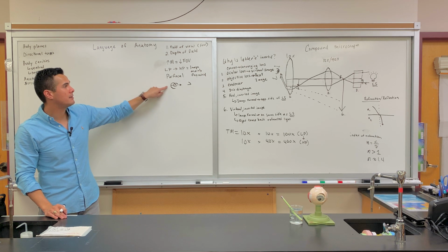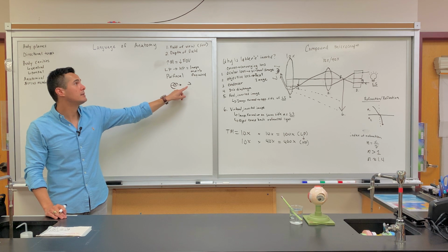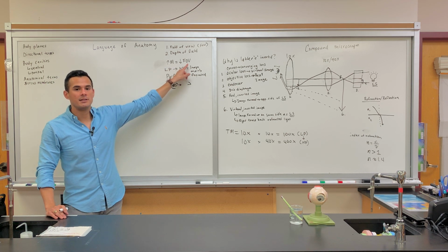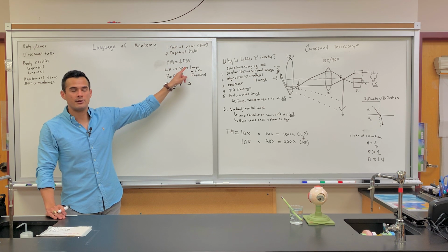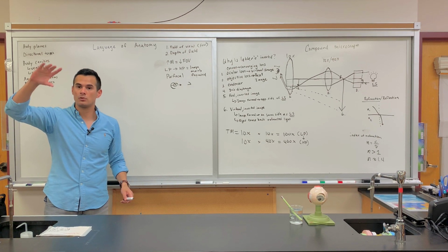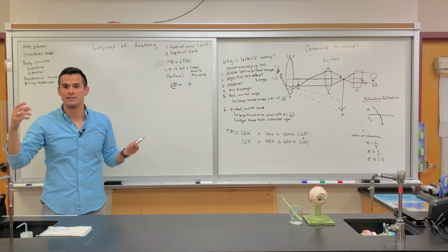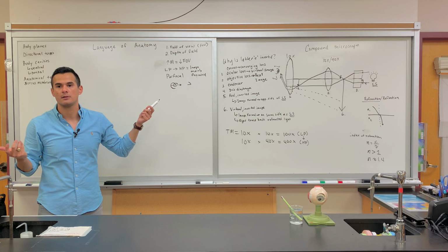So that was the field of view. You're zooming in on a particular region, and so as you increase the magnification, there's a decrease in the field of view, what you're able to see. It's kind of like when you use your iPhone and scroll like this, zooming in on whatever particular object you're interested in taking a picture of. So it's a similar concept here. Okay.